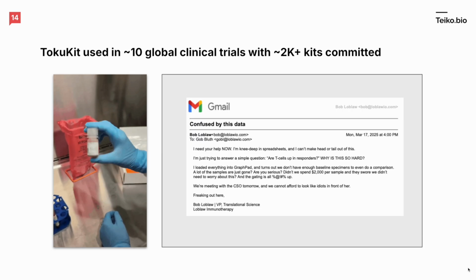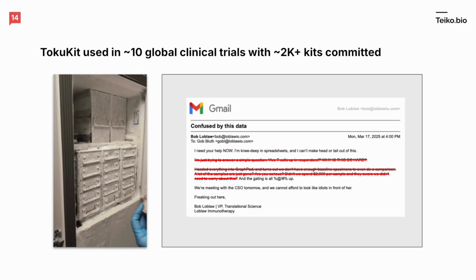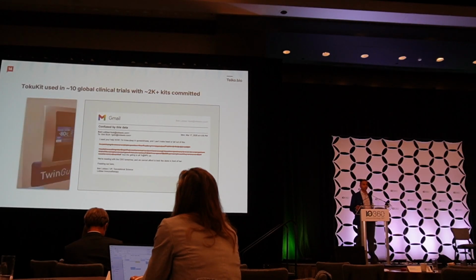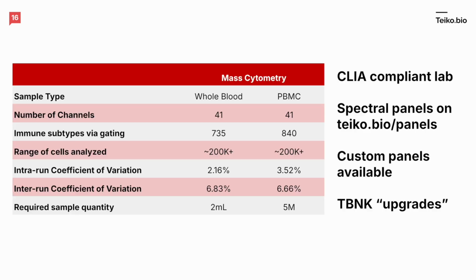So, he wrote this long email, and he had this whole issue with cytometry specimens lost. Okay, wow, that's already gone out of his email. So we just talked about sample collection. Now let's go to panel design. So remember, sample, panel, data.